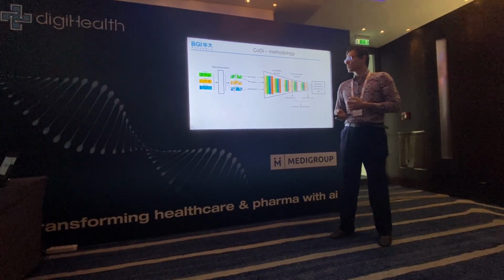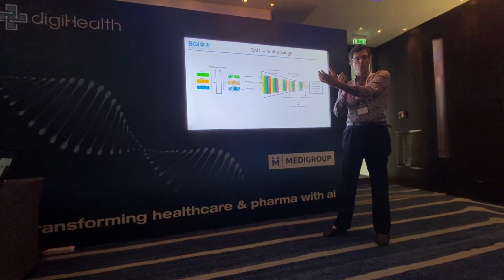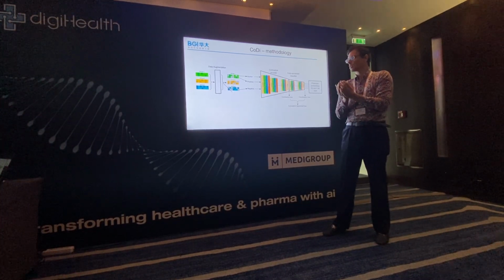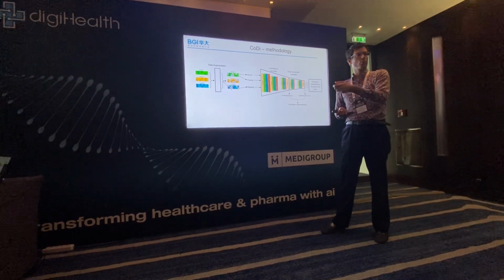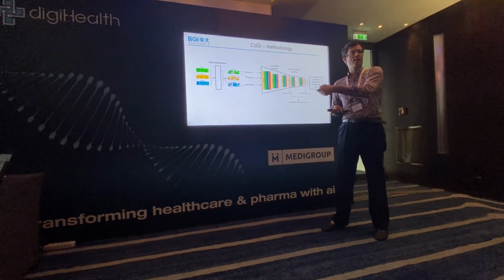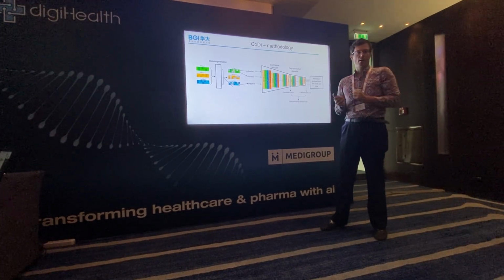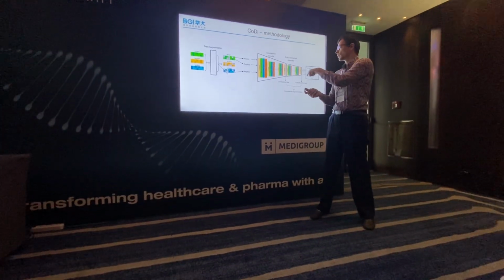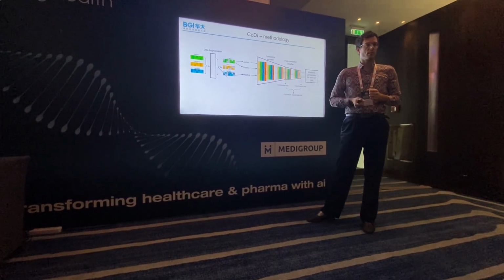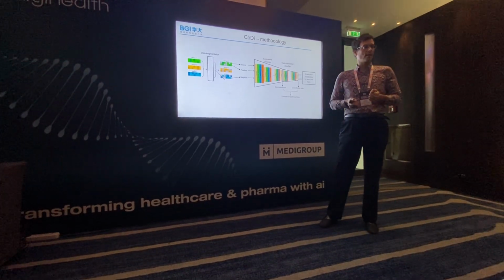We call it augmentation, but it's actually a kind of data reduction, because we want to bring these two distributions closer. We do it by randomly dropping out data, mimicking what happens during the sequencing process. So we have a similar number of genes in the cell during the training of this deep learning encoder as in the spatial transcriptomics data.